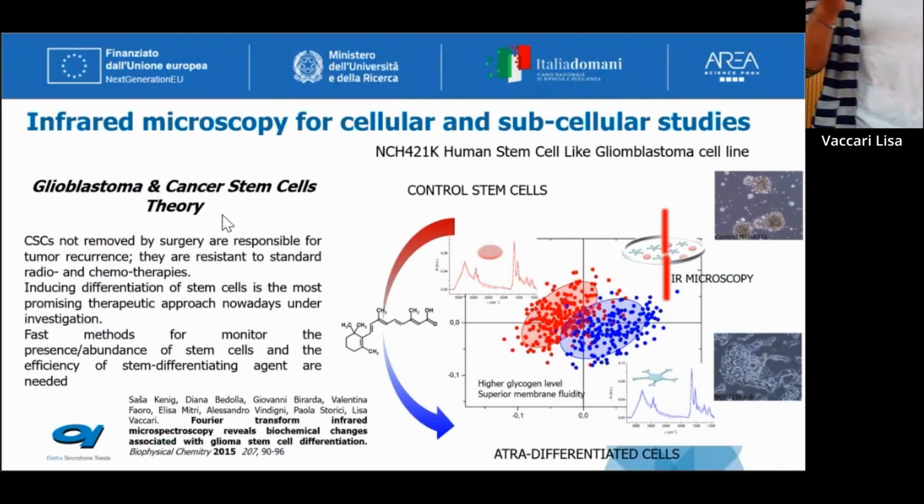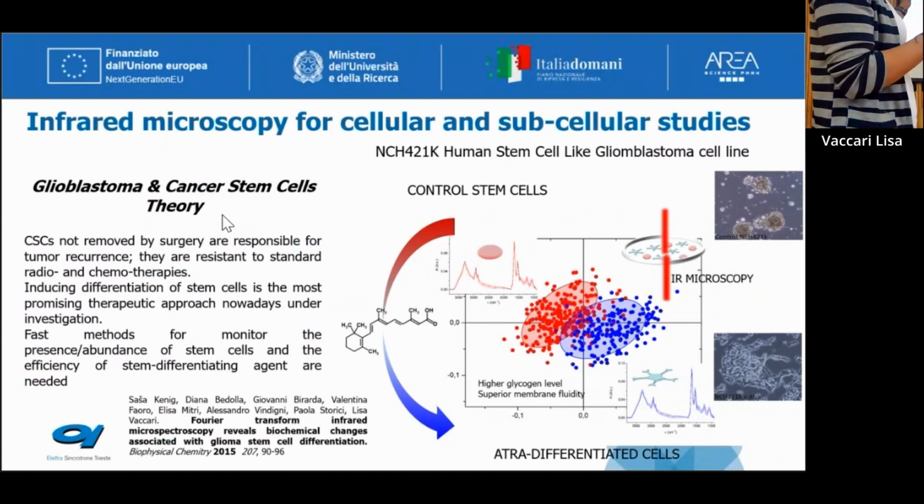So it's not a drug-based screening in the classical way, like macromolecular crystallography or cryo-electron microscopy, but I can study the phenotypes. This is something that we already started with our colleagues at the HGB, but I just show you this example to let you know which type of information on the phenotype we can obtain.